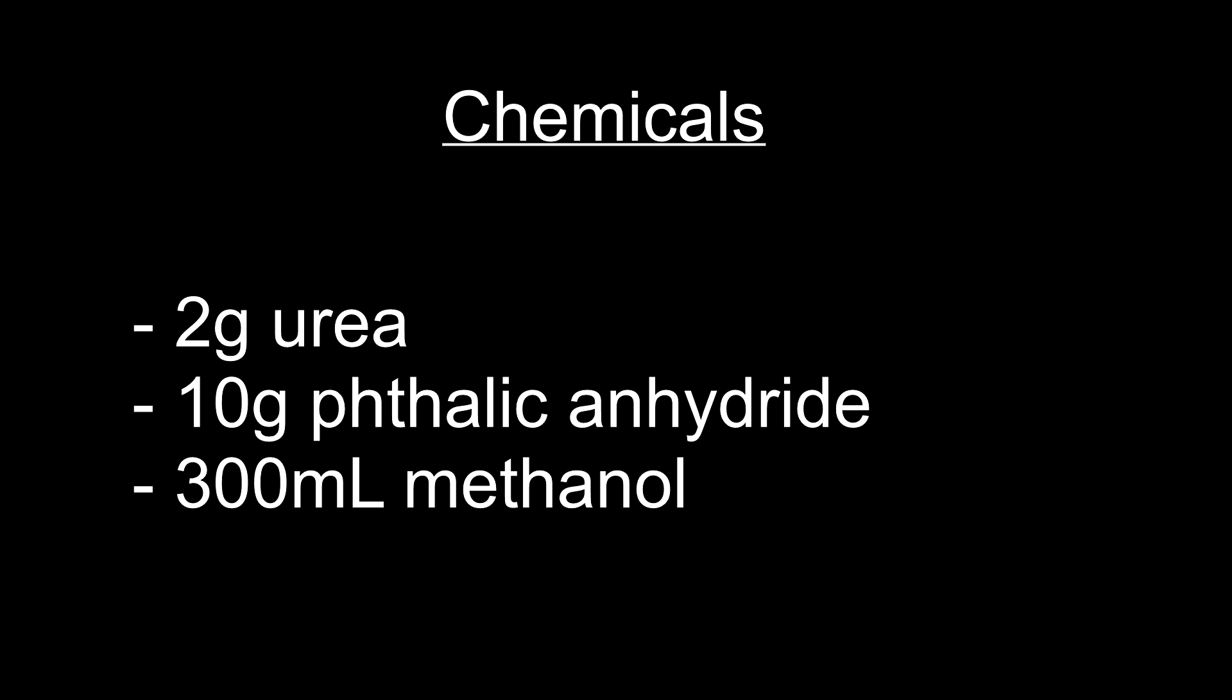For this experiment I used 2 grams of urea, 10 grams of phthalic anhydride, and 300 milliliters of methanol. I've shown in a previous video where you can get the phthalic anhydride, and the urea can be found in instant cold packs.